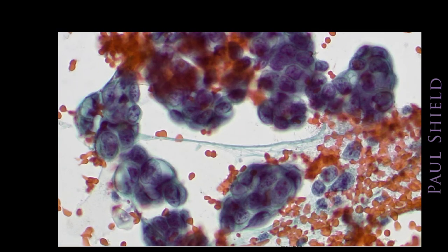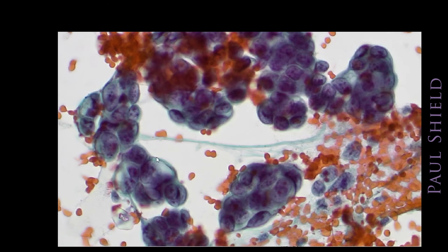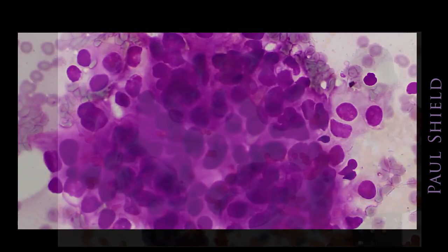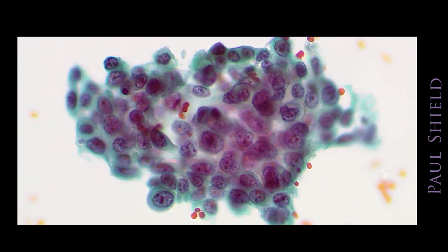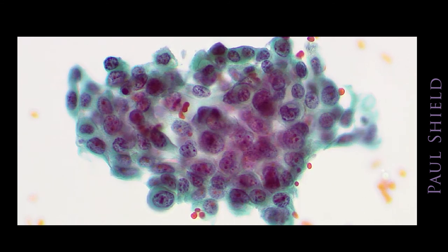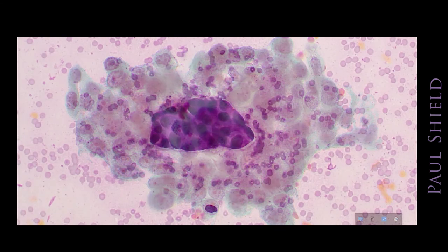This one's showing a ball of cells. It's fairly three-dimensional, and here you can see some more groups of these cells. They have cytoplasmic vacuolation, that's the clearing. They have almost a community border around the outside of the cells and the nuclei are arranged in tight little clusters. Just an example on the PAP of another group, and you can see there can be quite a bit of depth of focus on focusing up and down through this group, and you can see it's several layers deep, and that's characteristic of adenocarcinoma balls sometimes.